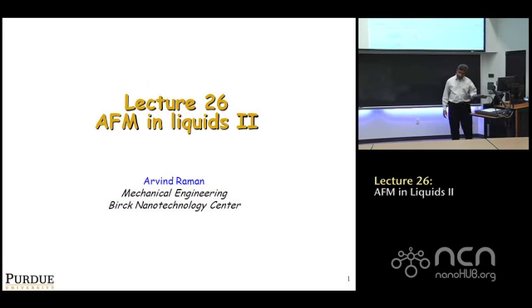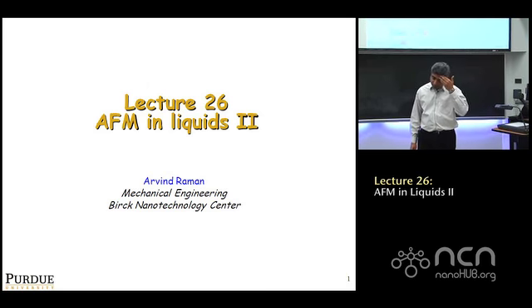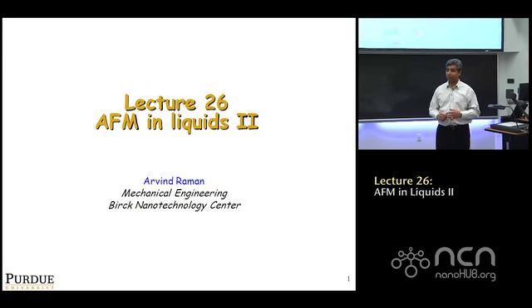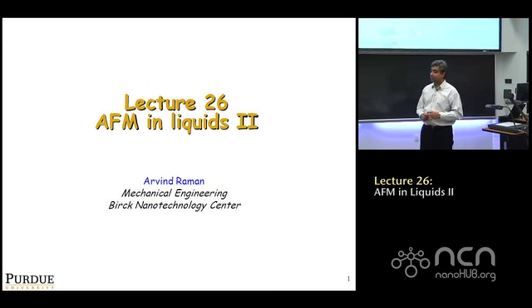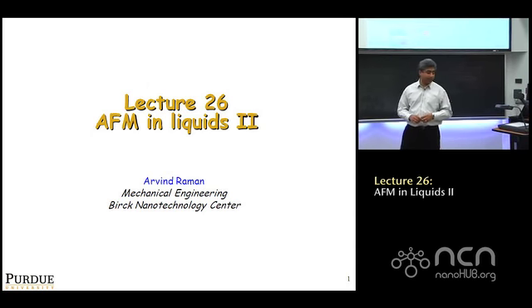Last time we were discussing some of the challenges that emerge when trying to do dynamic atomic force microscopy in liquids, and we reached the point where we talked about the forest of peaks and the origin of the forest of peaks, which I hope you all understand now, and what attempts people have tried to make in order to get rid of it.